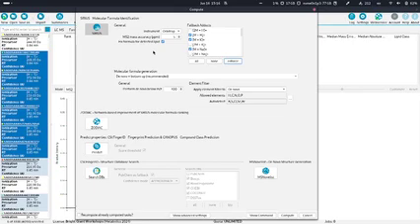I don't know if we will support multiple charge in the future. For natural products, usually the mass of the compound is quite small, so probably the single charged is still the major ion type. But currently it's not supported with multiple charged. So we will detect them, but we won't compute them currently.